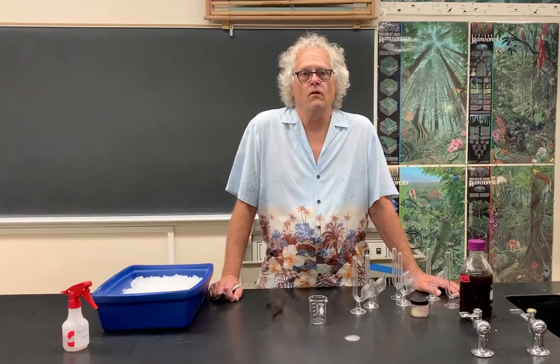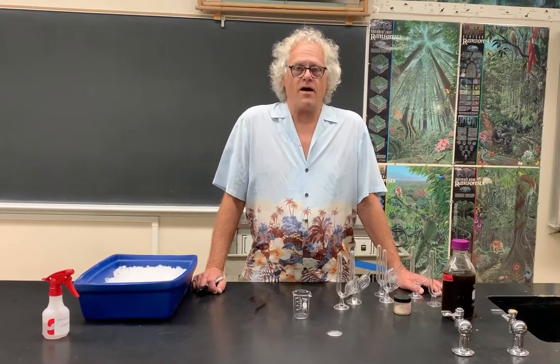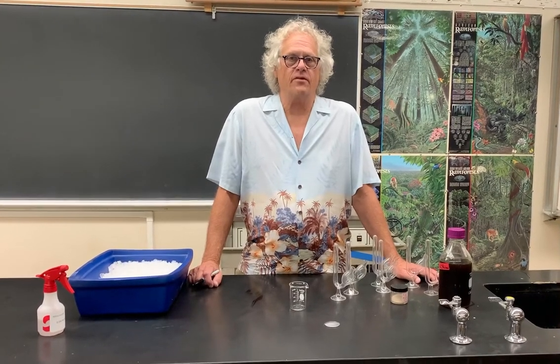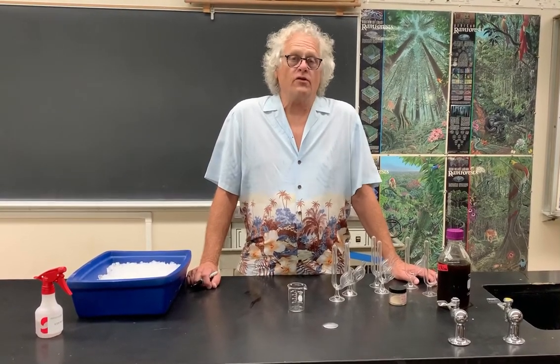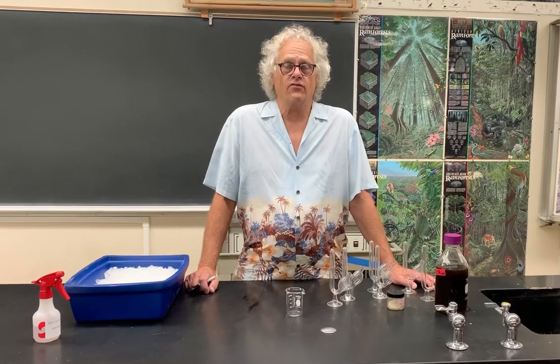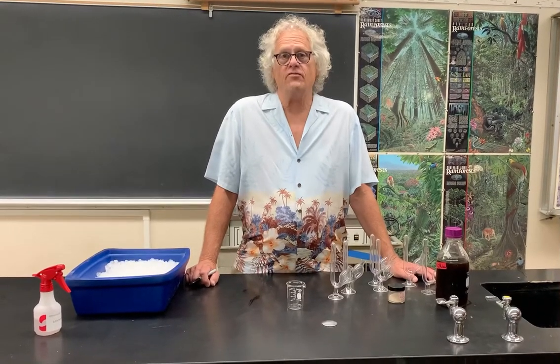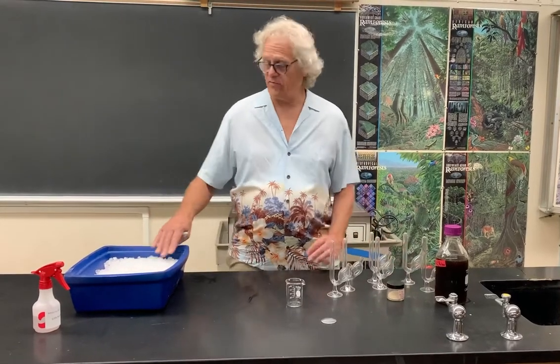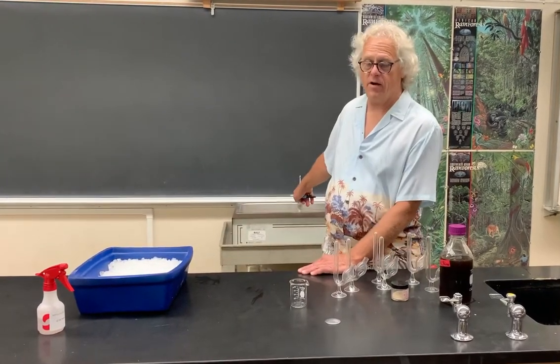Next. So now you all have generated a hypothesis about what you think is going to happen regarding the effect of temperature on gas production in yeast. Now we'll do an experiment to see if your hypothesis is correct by growing the yeast and measuring the gas production at 3 different temperatures: room temperature, on ice, and this warm water bath I have back here behind me.